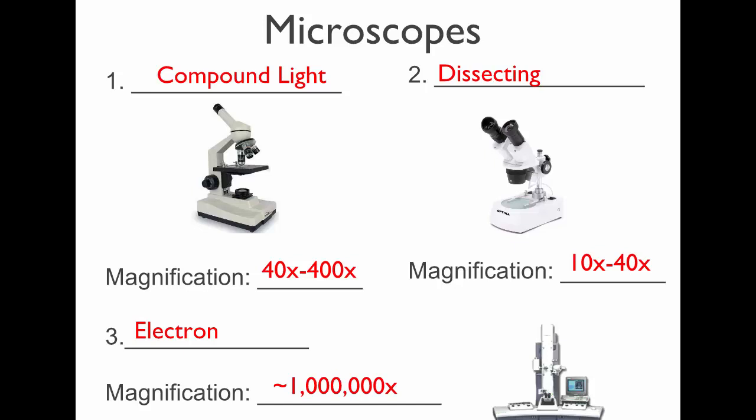So we don't have an electron microscope. They're relatively expensive, but they do have one at Whitesboro High School. I got to use it last year. They had to set up a whole separate room in their school for their electron microscope, but it's really neat. I went there last year, and I was able to use it. This is one of the things I brought in to look at with an electron microscope, a little feather from an owl, and we zoomed in on a certain part, and these are all the fibers that make up the feather of the owl.